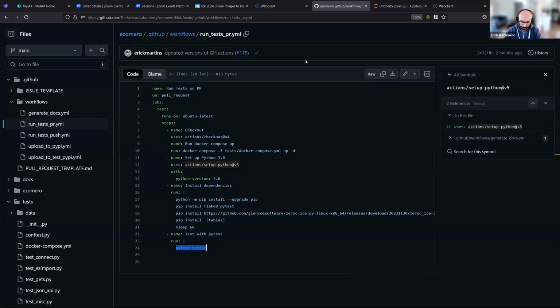I mean, Docker's totally fine. We went with Kubernetes specifically because it allows us to do things like if a container is down for any reason, it can re-up automatically. And also things like if for any reason you need to have multiple copies of the web server running on top of your backend server, that's also very easy to do. But yeah, it's totally fine to have a Dockerized version of OMERO running.